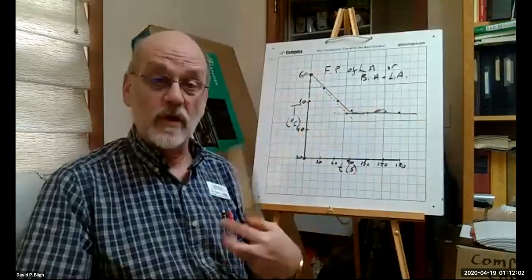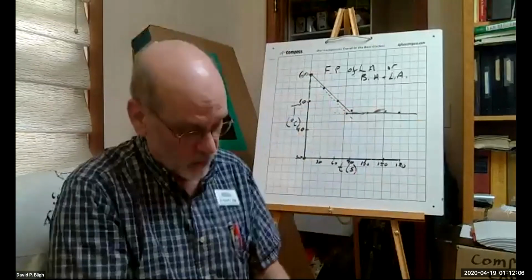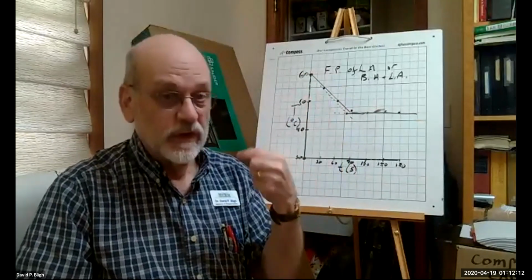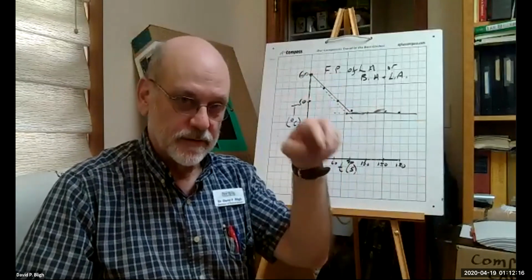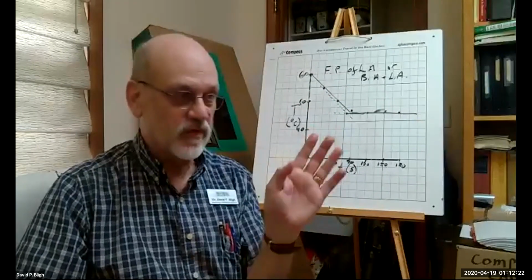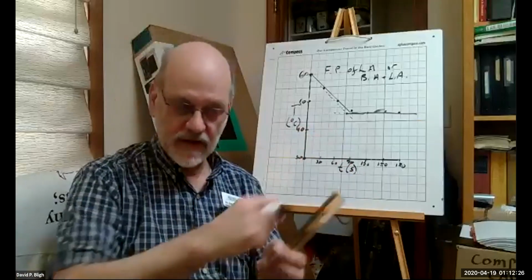But you also have your observation, right? You were watching, if we were doing this hands-on, of course, and you were watching the tube, then at a certain time, you would notice the appearance of solid suspended in the liquid, very fine particles. And you would call that out, the observer would call that out, whoever's recording the values would make that note.